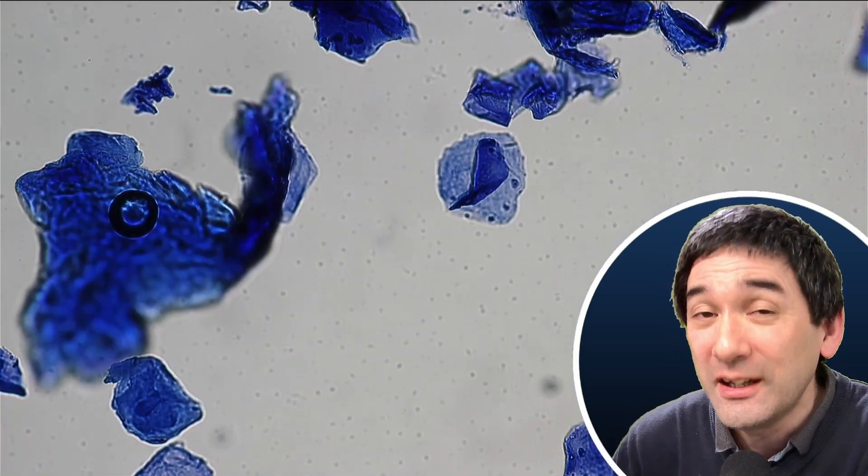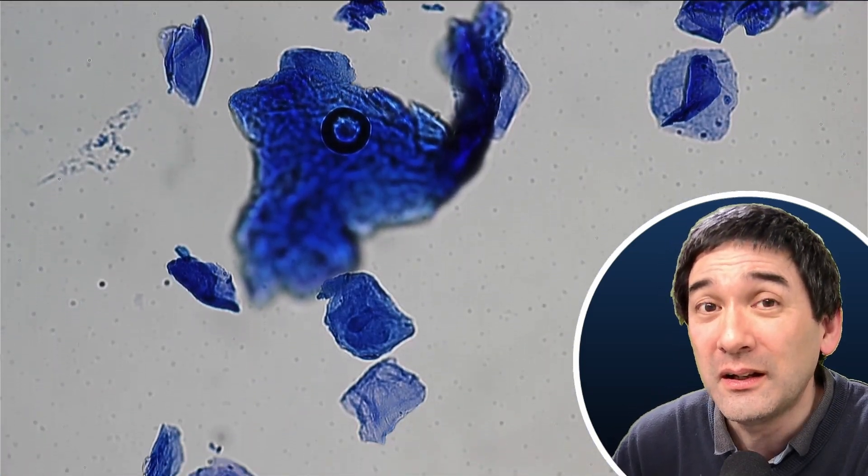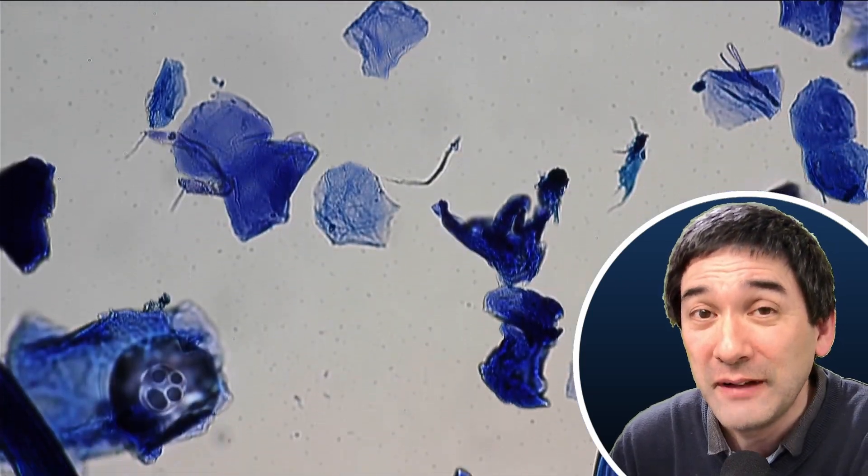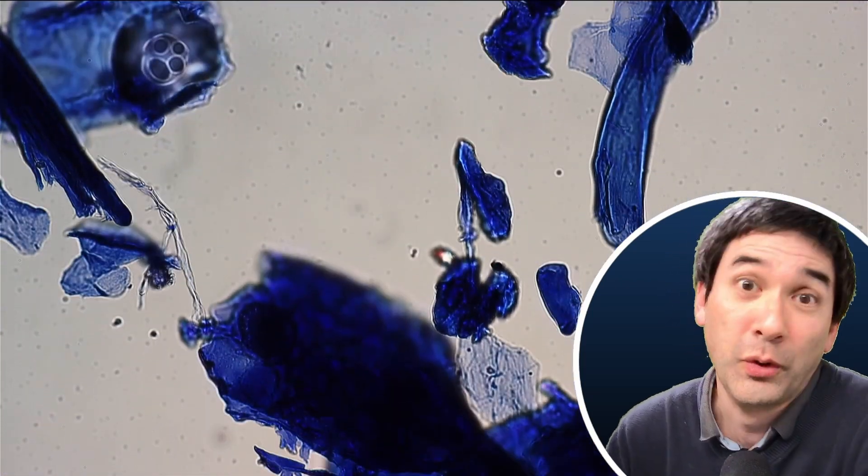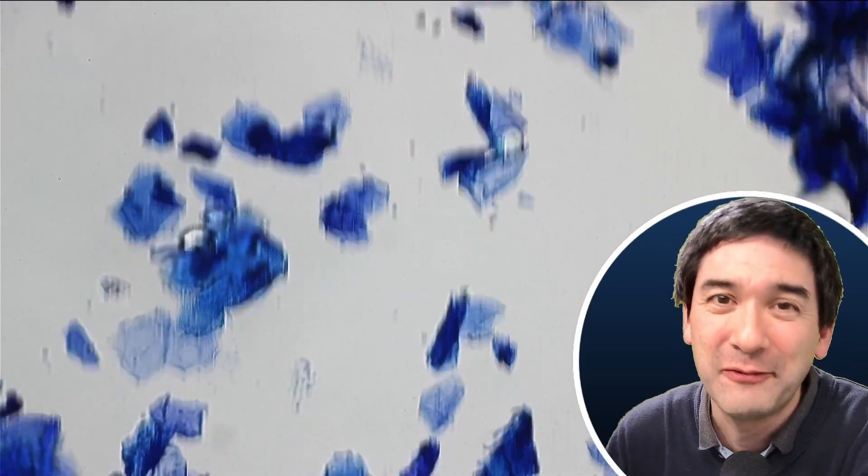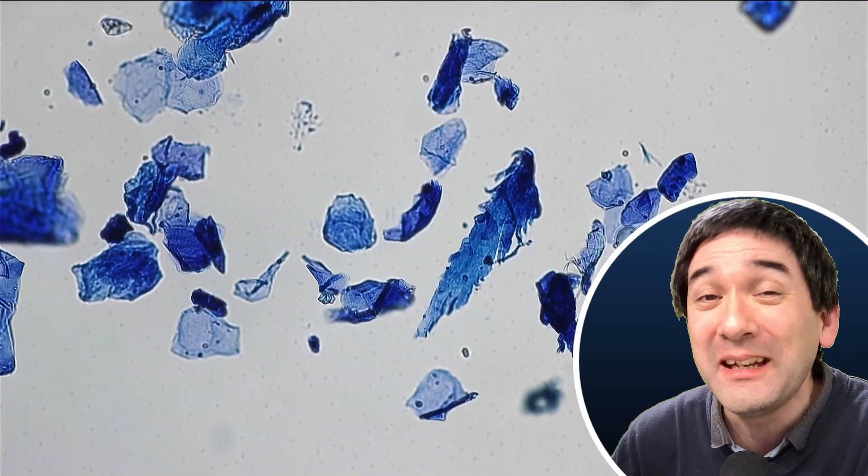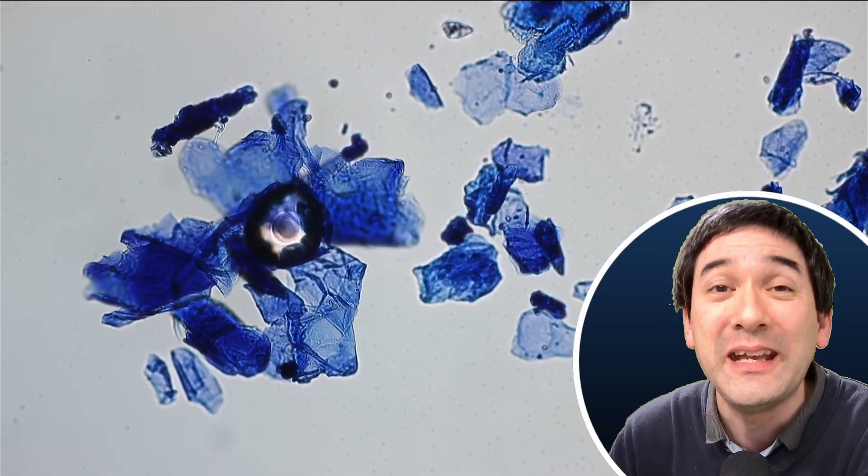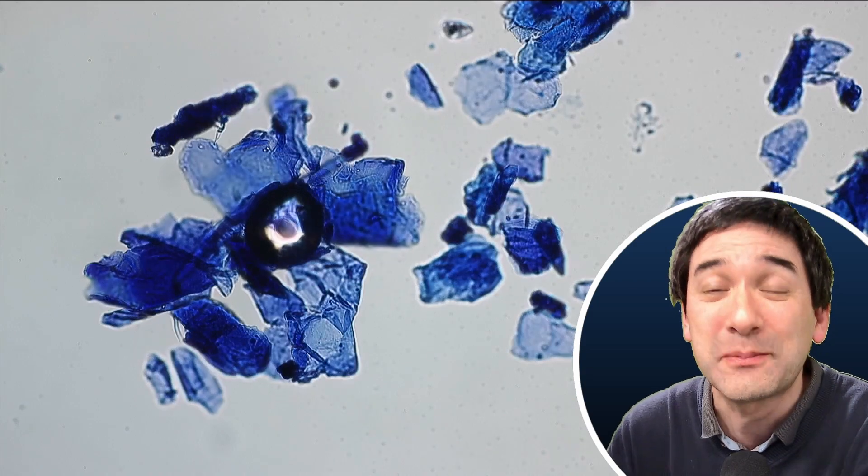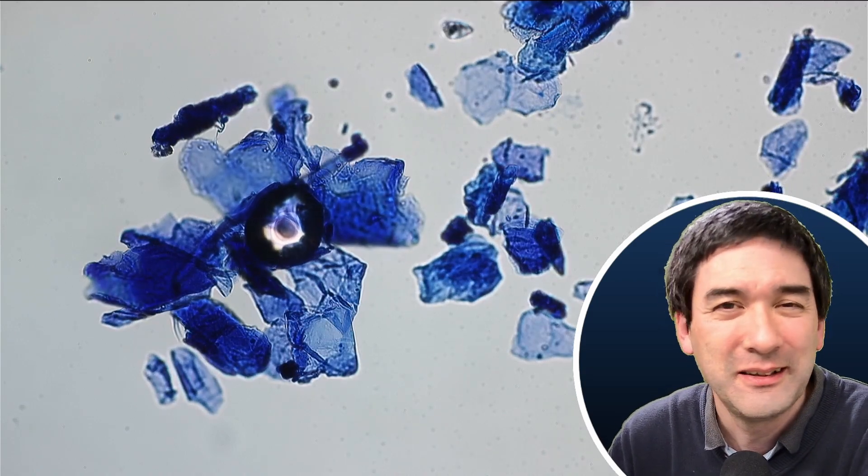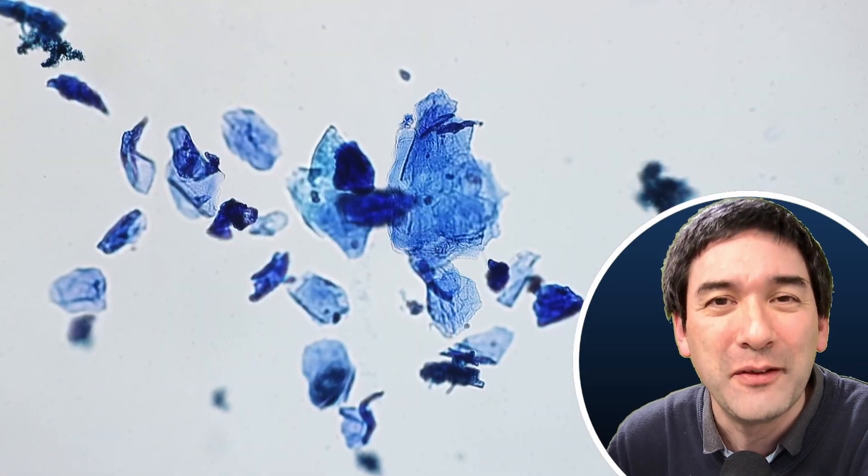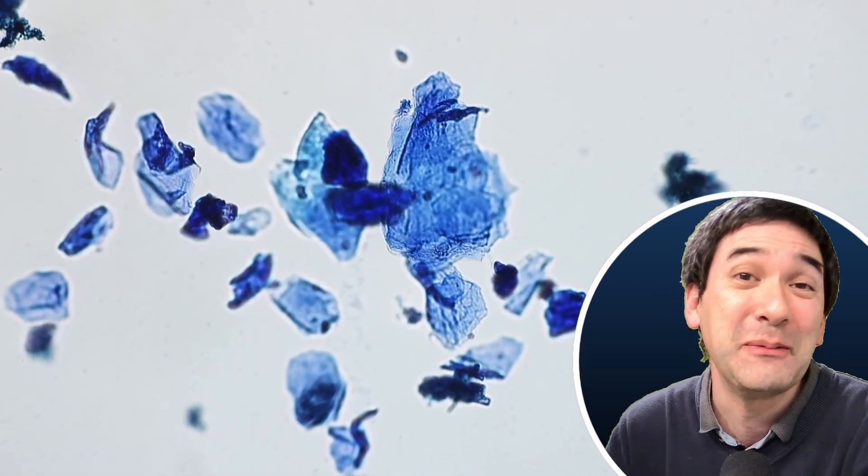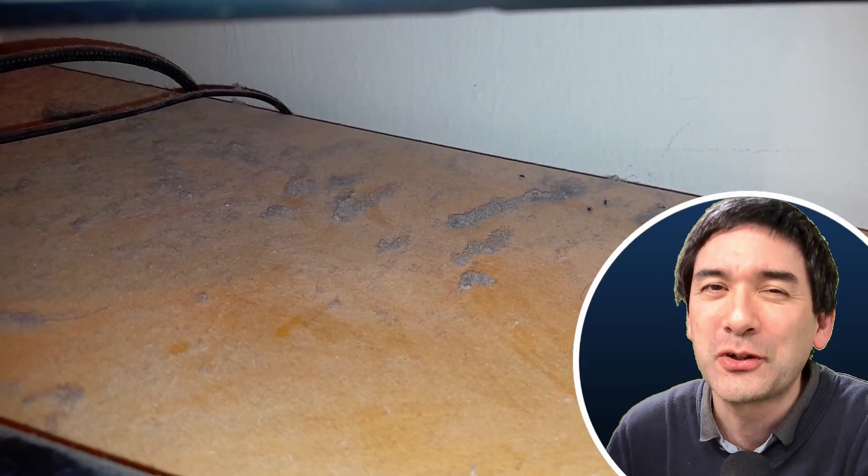Now, essentially, dust mites will eat those skin flakes. Obviously, unfortunately or fortunately depending how you see it, I was not able to find any dust mites here. Maybe I have to look a little bit harder. But that's also a good sign because some people are allergic to the end products, to the excrements, to the waste products that those dust mites form, and it's therefore not a good idea to have them around. In any case, I was not able to find any of those, but maybe that's a project for the future to hunt for some dust mites here.